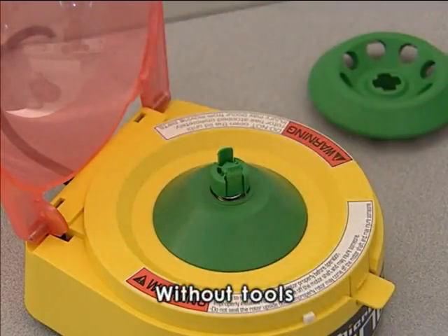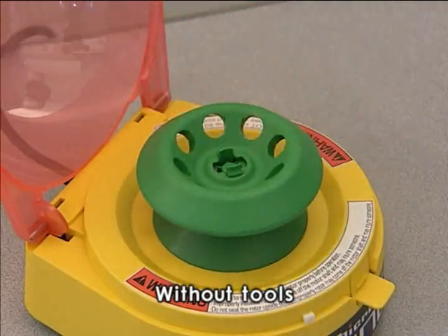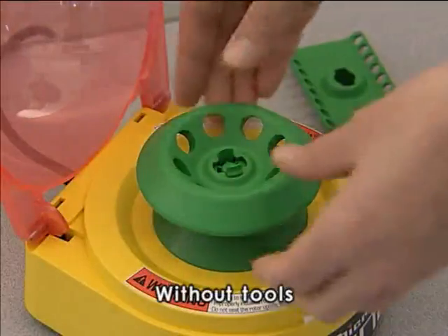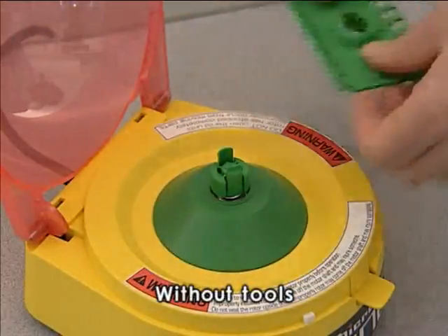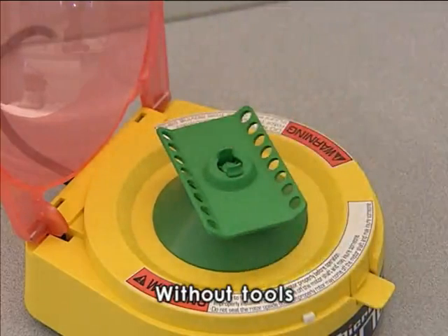The rotor can be easily removed for replacing. Using both thumbs, press the tab on either side of the shaft and pull the rotor straight up off the shaft. Align the tab on the motor shaft with the groove in the micro tube rotor and press the rotor down until it clicks into place.